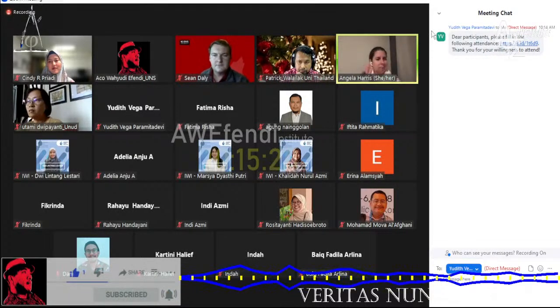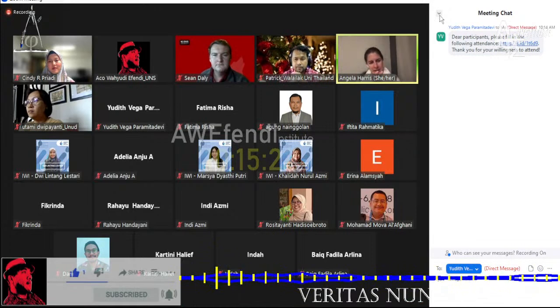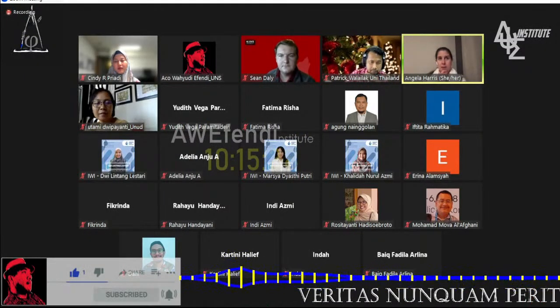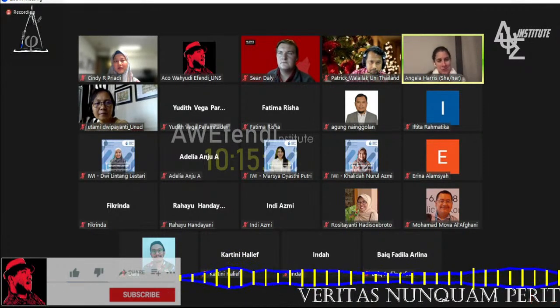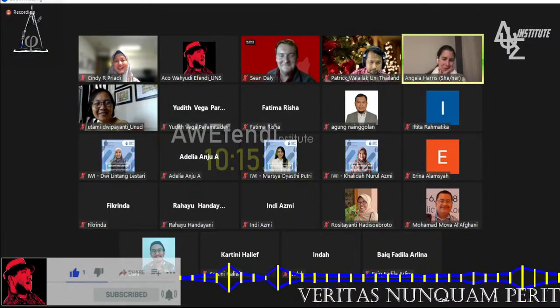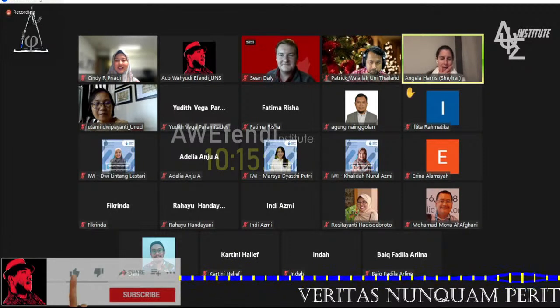$6 to $8 a sample, and then IDEX is closer to $10 to $12 per sample. One is a little easier to set up, and you could set it up in your bedroom. I've done culturing and set it up in a bedroom that I was staying in, for the sample processing.